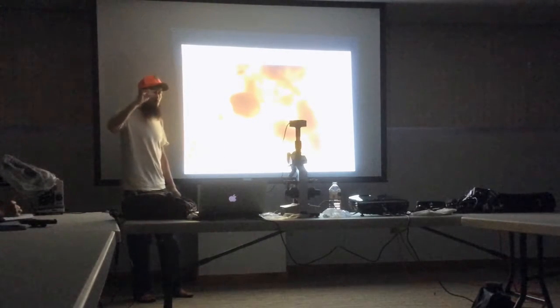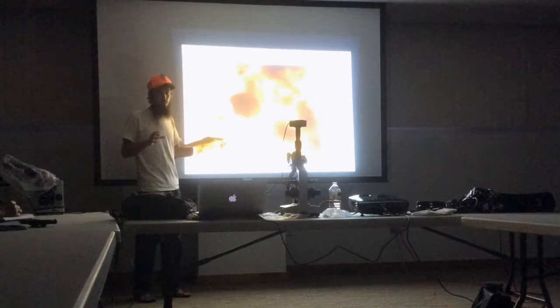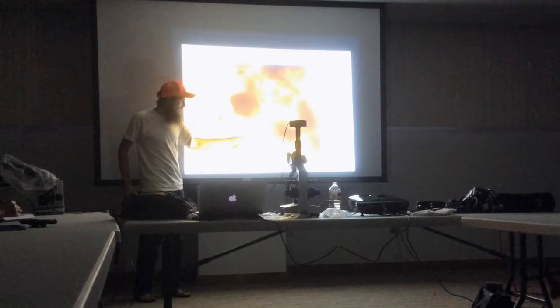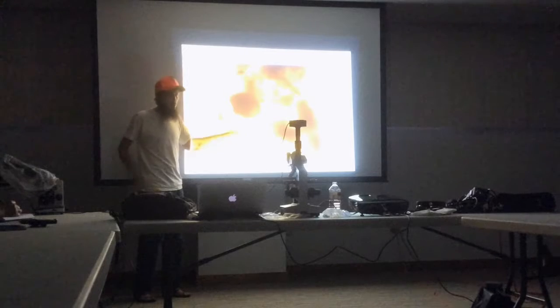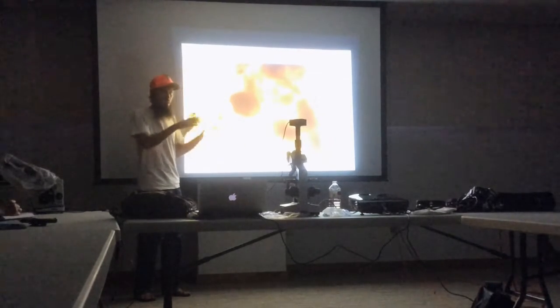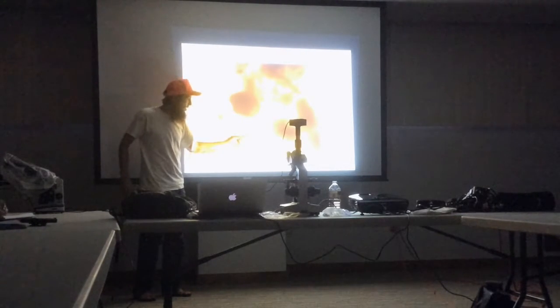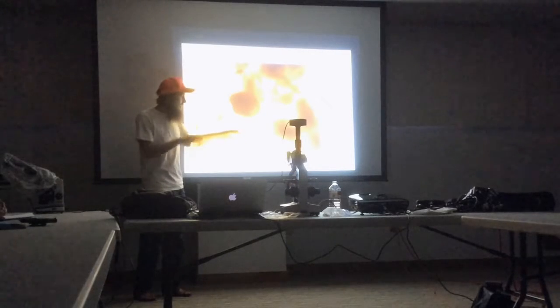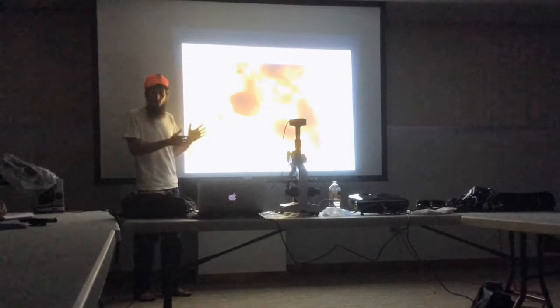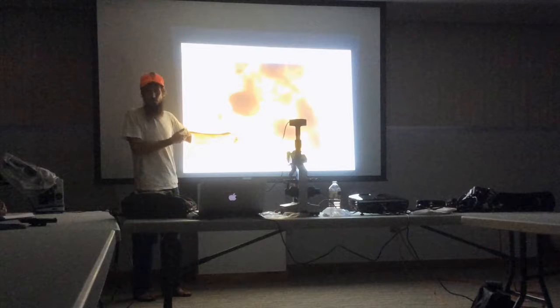I'm going to assume that that's 1 micrometer in length, because bacteria are typically about that size. And you see how it's dancing around out there. You could take maybe 3 or 4 of those and put them side by side across here, like 1, 2, 3, 4, and that would be the width of this fungus, right? So that gives me a scale to know that this fungus is at least greater than 3.5 micrometers. So I would say that this is definitely a beneficial fungus.